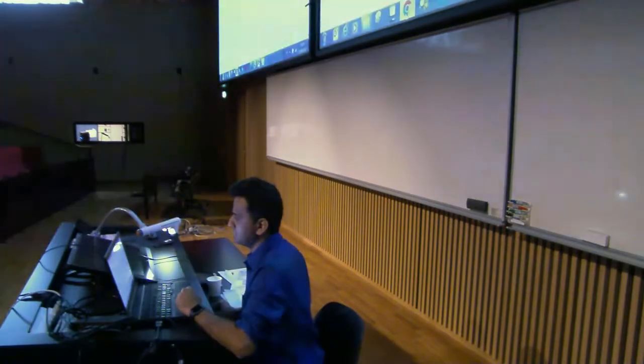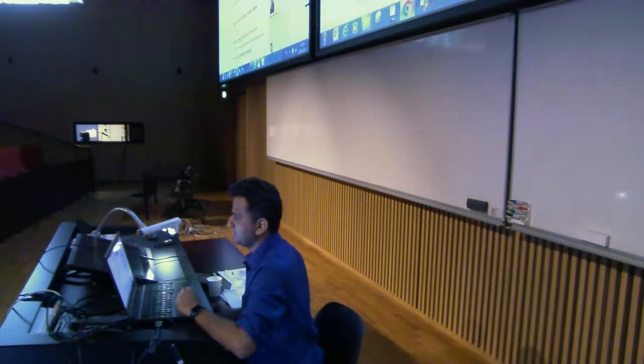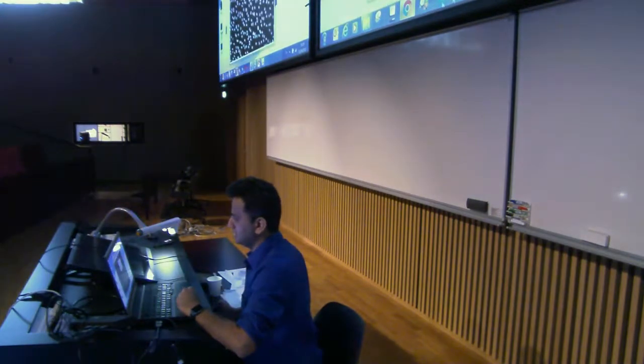By the way, I have covered everything here. If you go to image restoration, there is this link available in this whole platform. You can see the image and data analysis related things, a seminar on image processing and segmentation. You will see all the explanation about the image processing and segmentation algorithms. So do not do this, only do it for making a mask. Okay.